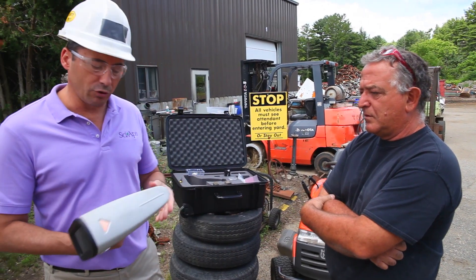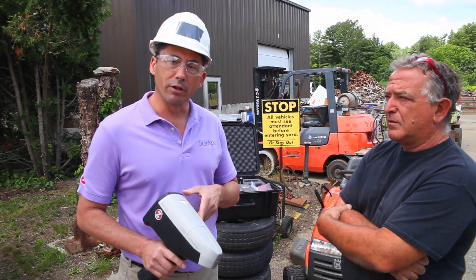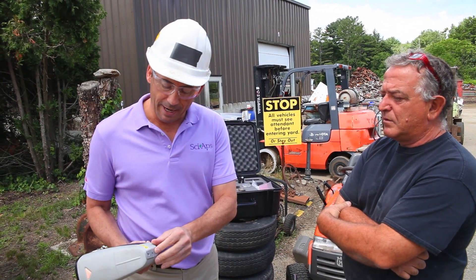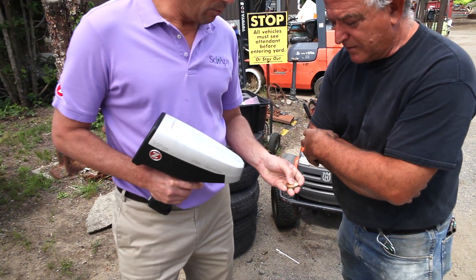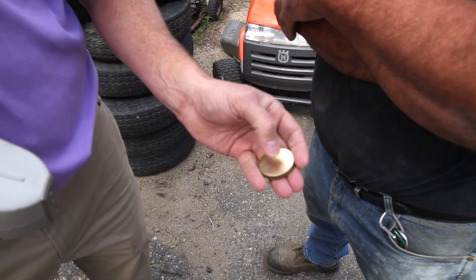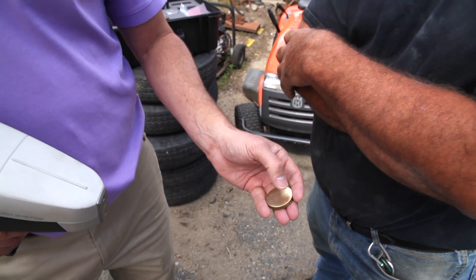I was just showing John this is the actual analyzer. One of his questions was, what does it shoot at the material if not x-ray? So what this does is it fires a laser. The laser comes out of this little aperture and is focused at the front surface, so the laser makes a small burn into the material. A good example is this copper alloy — you can see the burn, a little mark it makes. It blasts off a little bit of material and vaporizes it, and as that cools, it looks at the light that comes from the various elements that were in that material. So it looks at optical light as opposed to x-ray light.